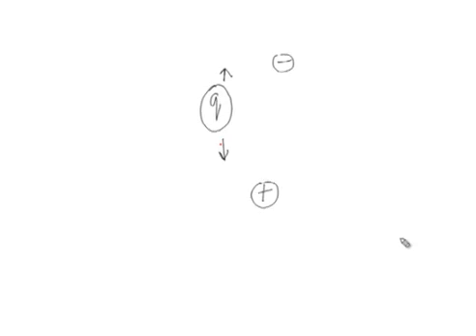Now, earlier, when electrophoresis started with the work of Tiselius, it was mostly done in free solutions. So, there were a lot of problems of diffusion and other things. We will come into that a little later.